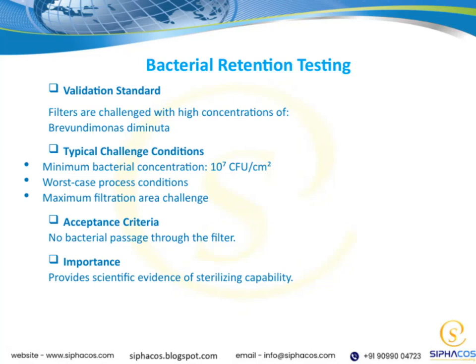Now, let's take a closer look at bacterial retention testing and the validation standards we follow. In this testing, filters are challenged with high concentrations of Brevundimonas diminuta, which is a standard challenge organism because of its small size and relevance to sterilization validation.